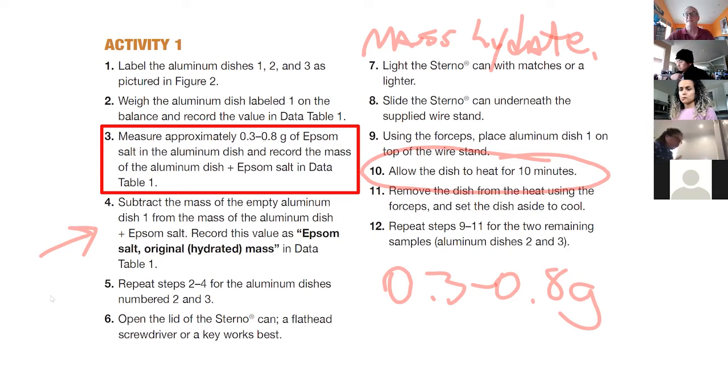Let it go for at least 10 minutes till basically things stop happening. The melting has stopped, the popping has stopped, and generally nothing is happening that you can see. The crystals in the dish don't change anymore. That basically means that all the water has been driven off.